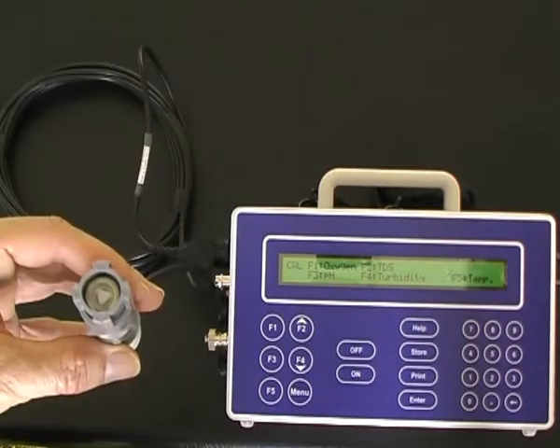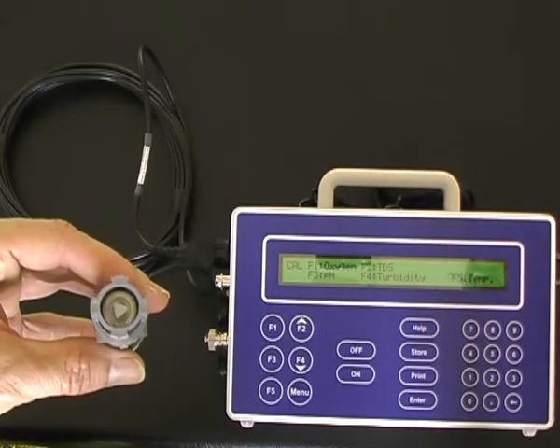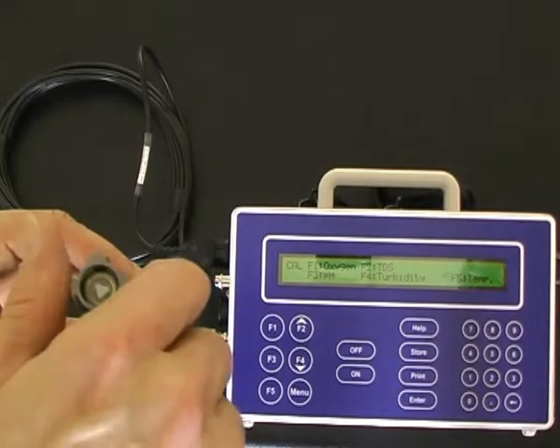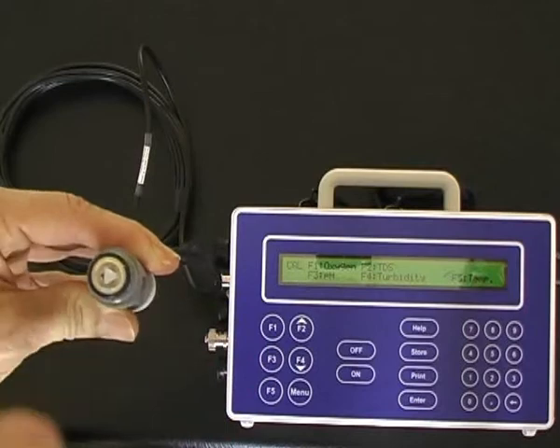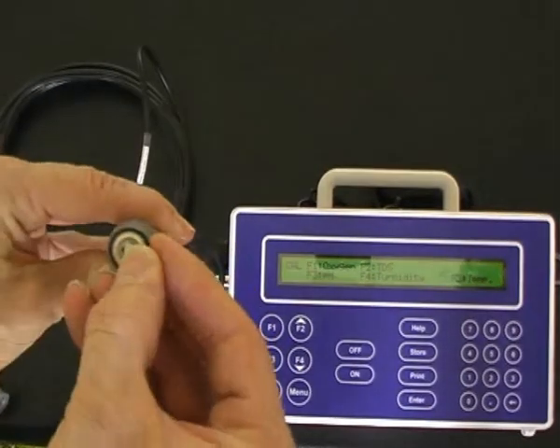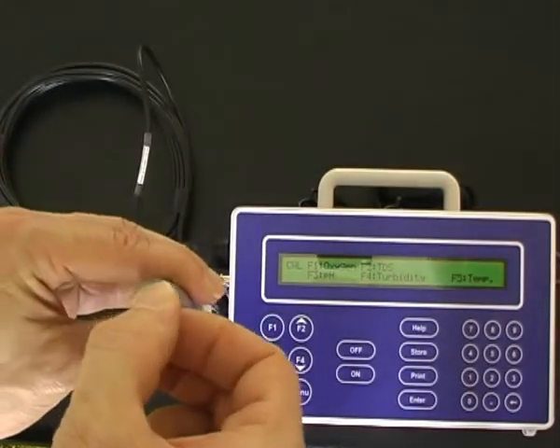The dissolved oxygen sensor must first be prepared for measurement. Remove the guard over the membrane, then remove the O-ring and the Teflon membrane.